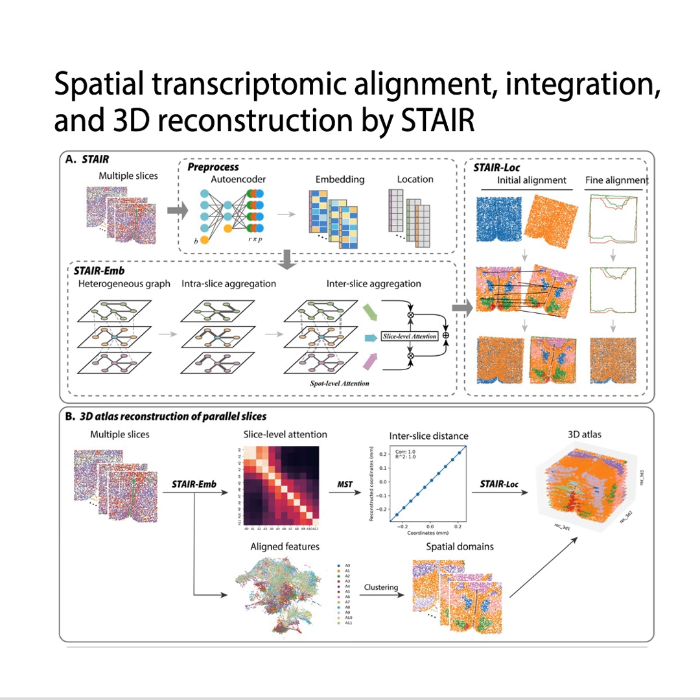Perfect? What do you mean by perfect? I mean, the Pearson correlation coefficient, which measures how accurately the positioning matched the known order, was 1.0. A perfect correlation. The normalized mean squared error and the misordering rate were both 0. Zero error. So it got the order exactly right and the spacing perfectly correlated. Exactly right. Near perfect positioning based purely on molecular attention.